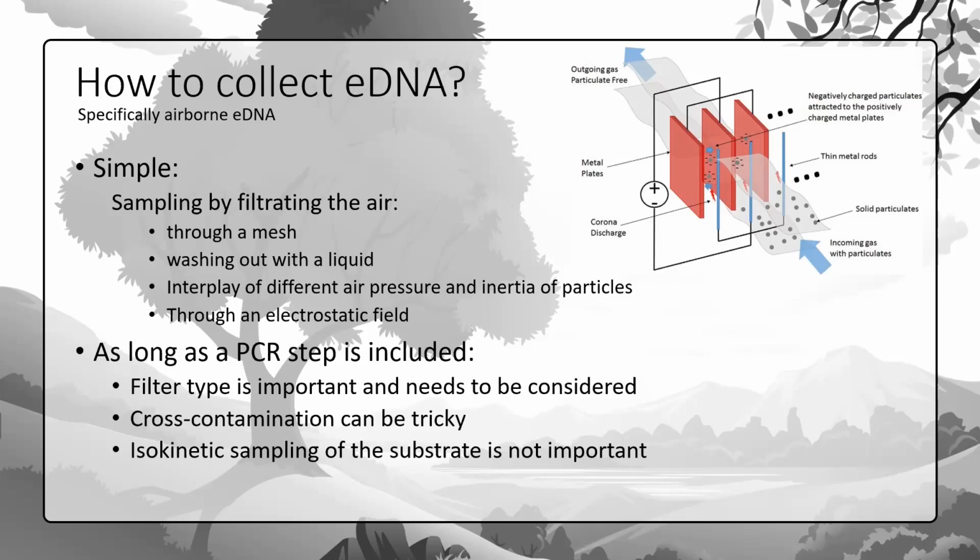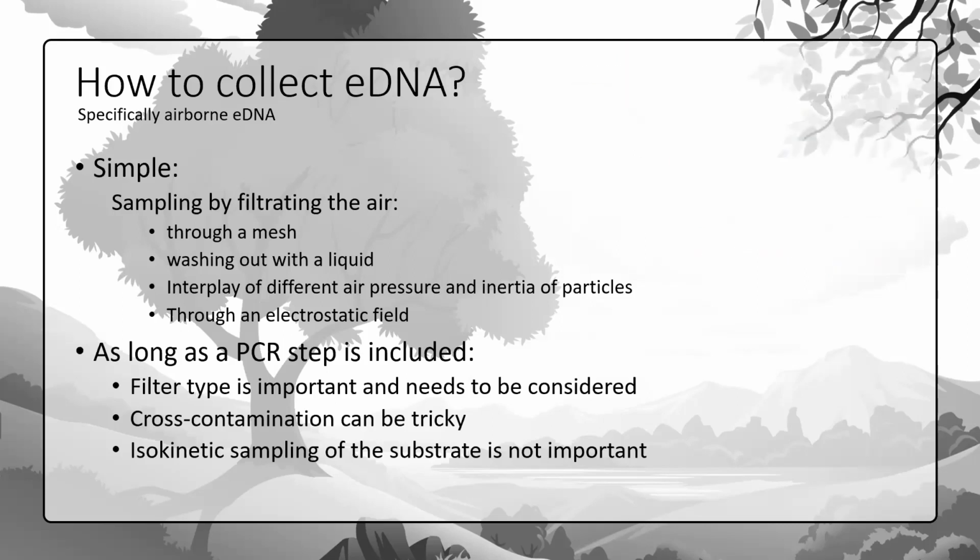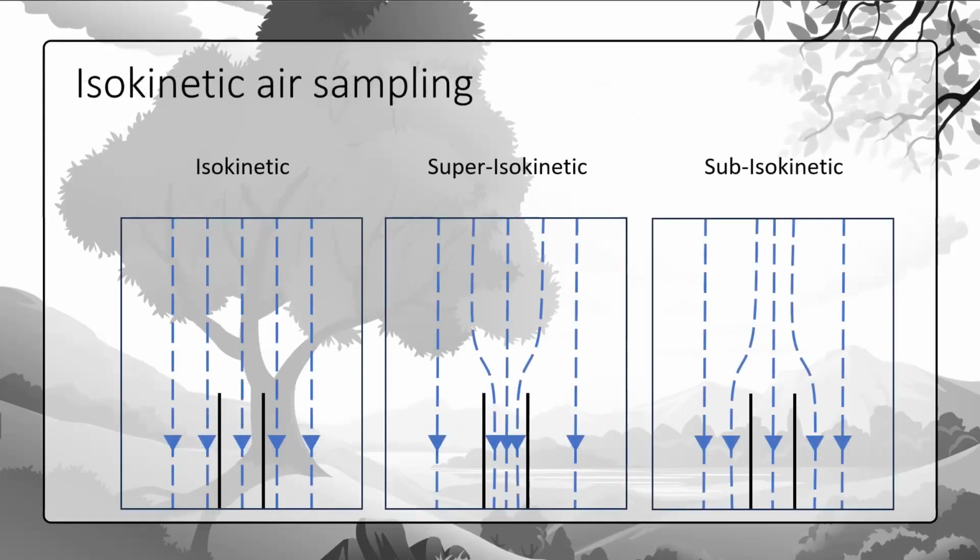Quantitative, in this case, means you want to know how many spores, for instance, you collected, and therefore the density of air in this certain time frame. Of course, I can't expect that you know what isokinetic sampling is. I prepared a more complicated animation that tries to explain what isokinetic sampling is.